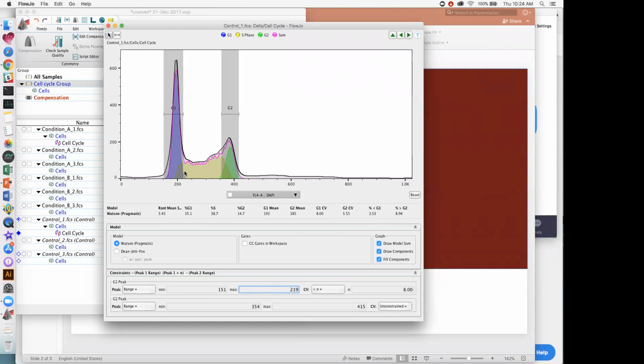Just like every other instrument that we use in the lab, there's an error rate, in this case roughly around 8%. Okay, 7 or 8% in terms of the photon counting error. Now, if the spreading is associated with the error of the machine, we would expect that the error that you see here is exactly the same as the error that you would see on this side.